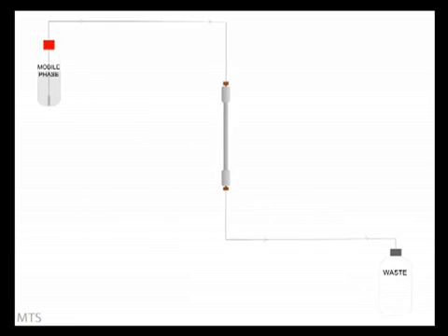So far, we have an HPLC column connected by tubing and compression fittings to the mobile phase reservoir. We will add a vessel to collect the waste at the other end of the column. To keep the mobile phase moving through the column at a steady flow rate under pressure, we need to introduce a pump in the flow path. This instrument is designed to draw the mobile phase from its reservoir and deliver it to the column at the required flow rate.